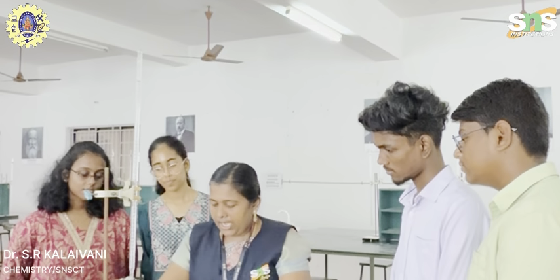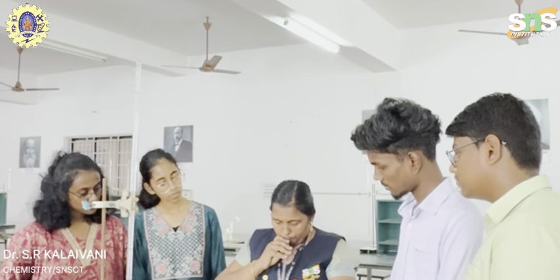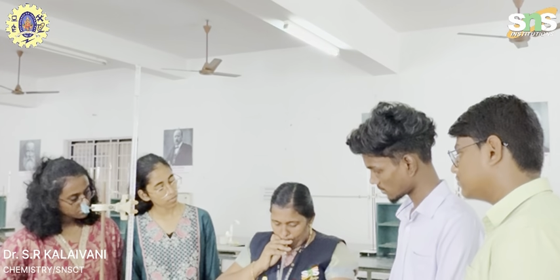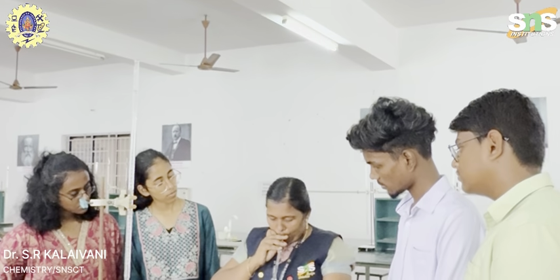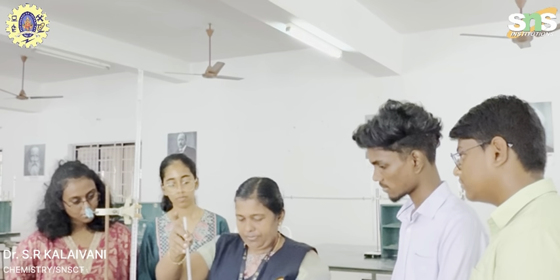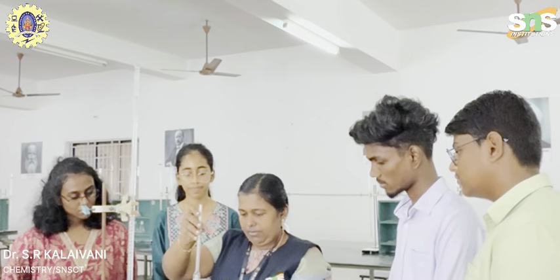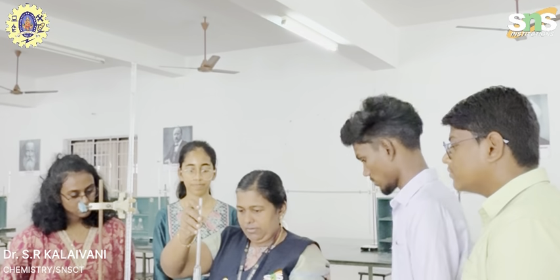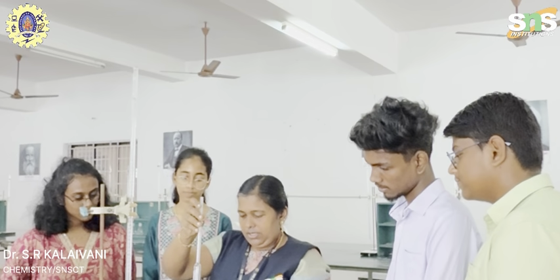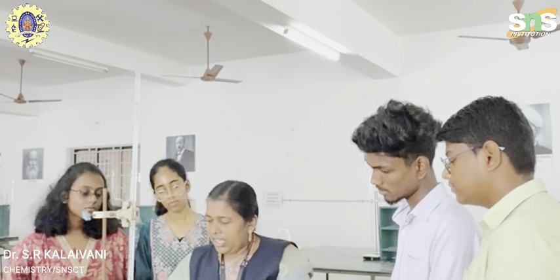So, 20 ml of standard hard water is pipetted out. Then we are adding ammonia buffer.